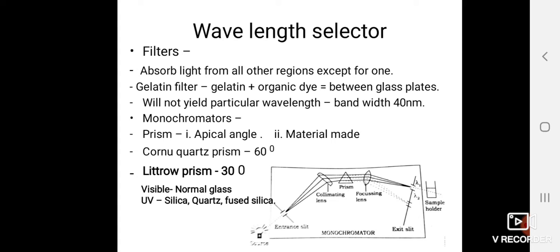It's also called a monochromator, because here we are supposed to get a particular wavelength of light to interact with the molecule and study the particular substance. The light coming out of the source is not of a particular range, it doesn't fall into a small range of electromagnetic radiation, but instead it's a complete stretch of hundreds of nanometers of radiation coming through.